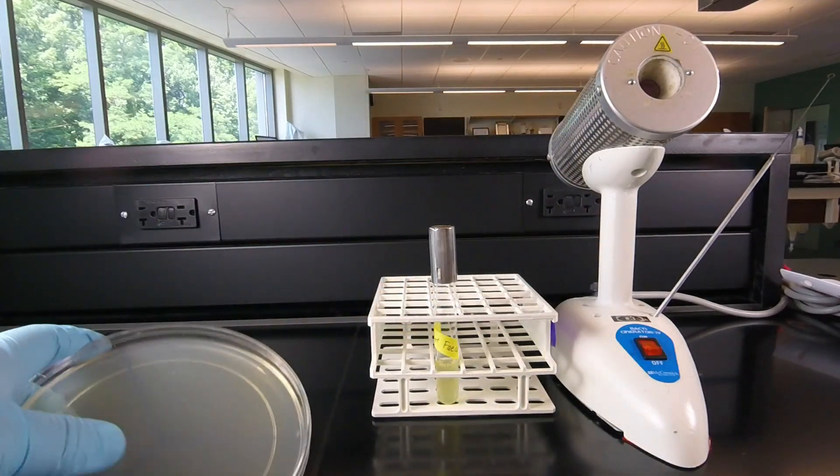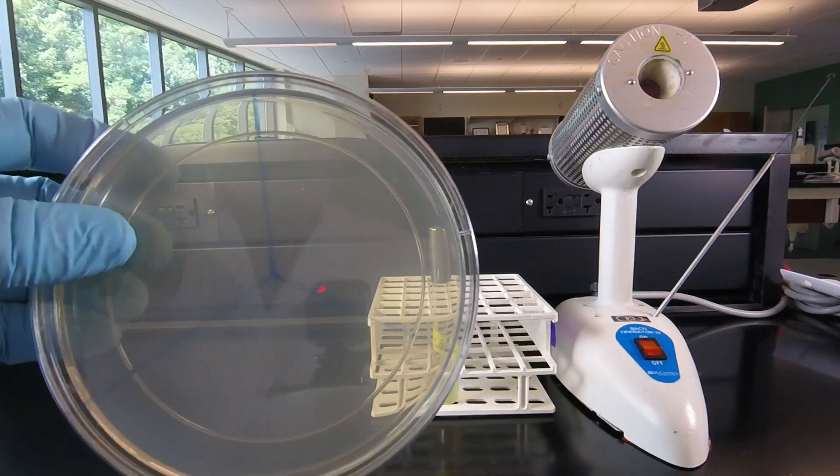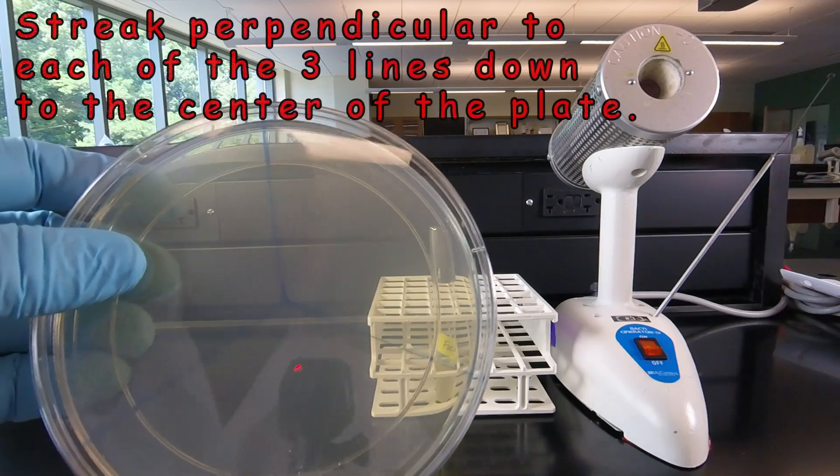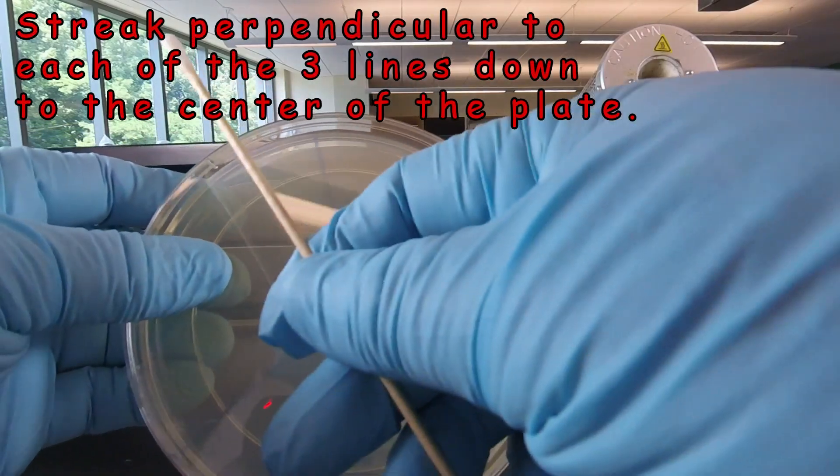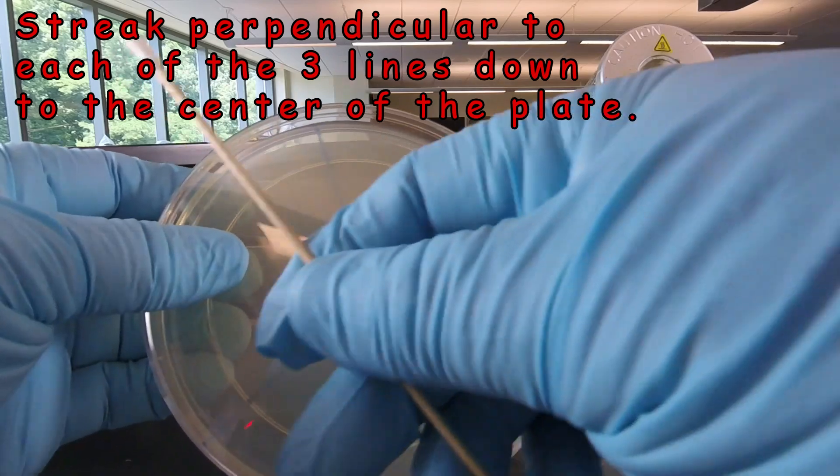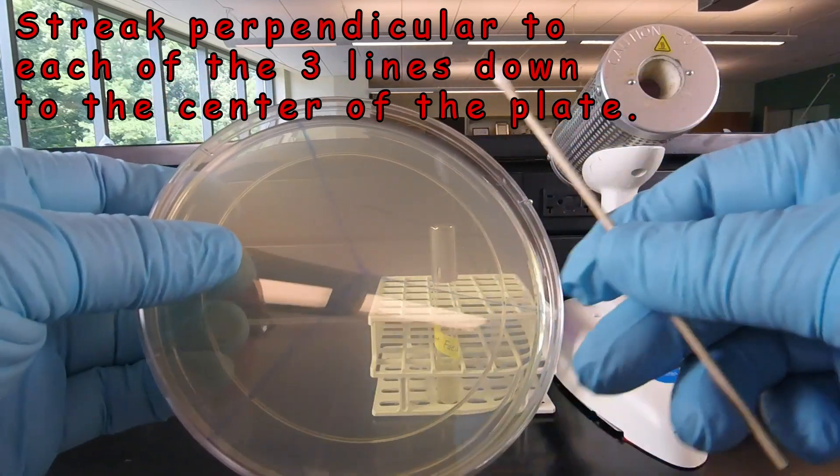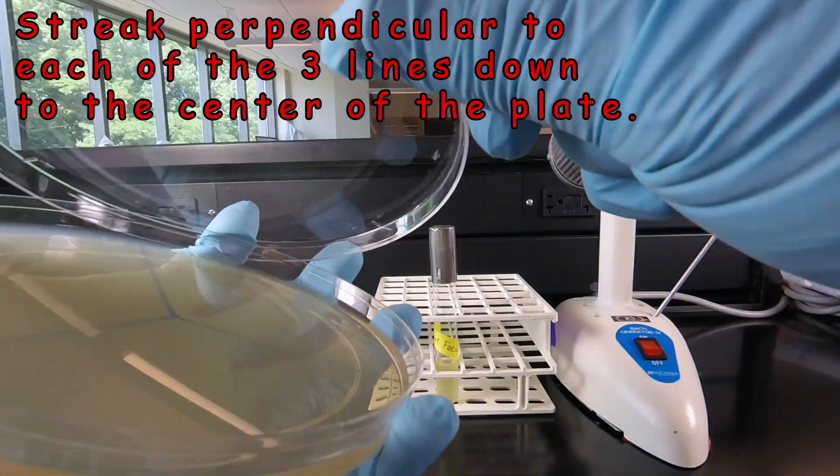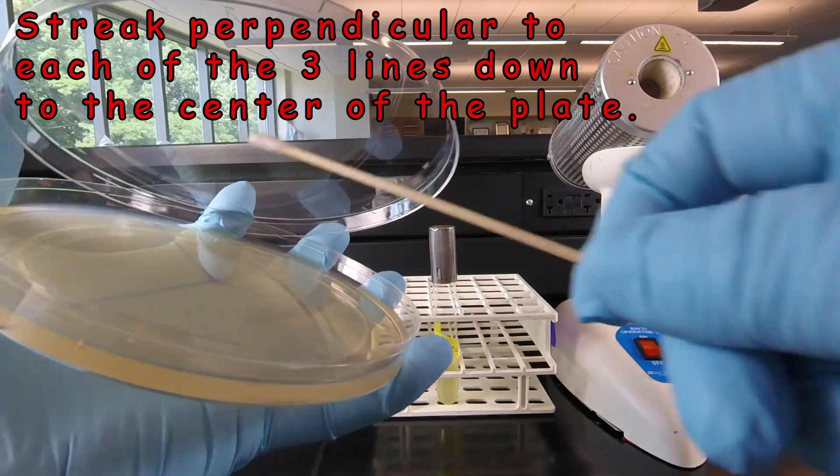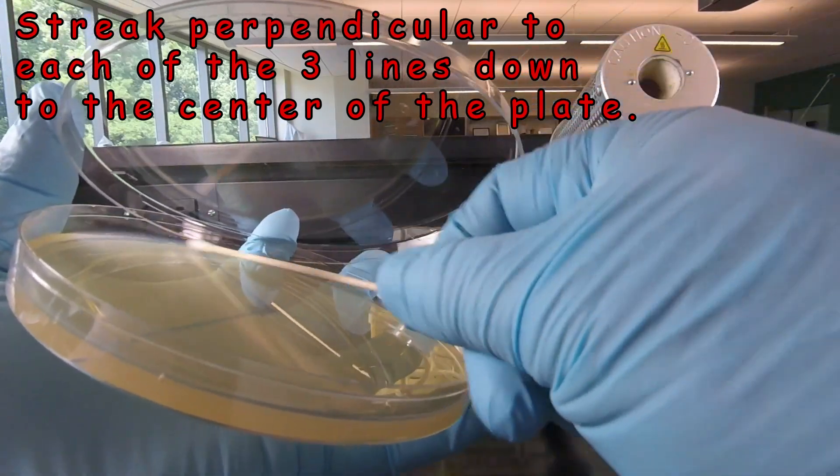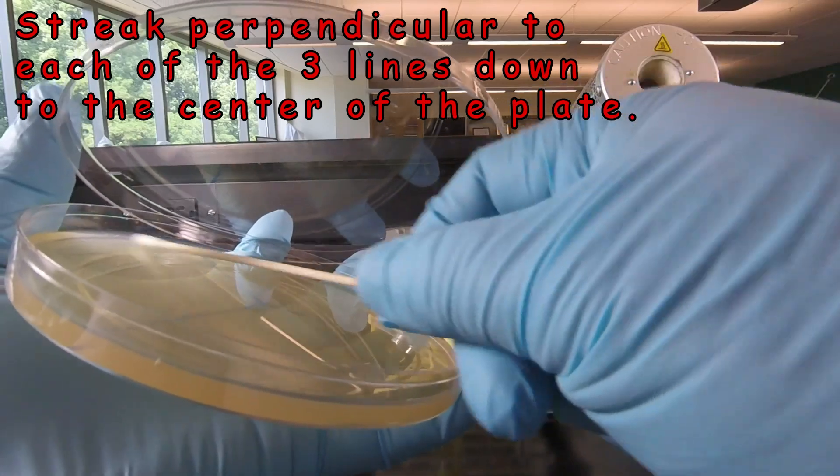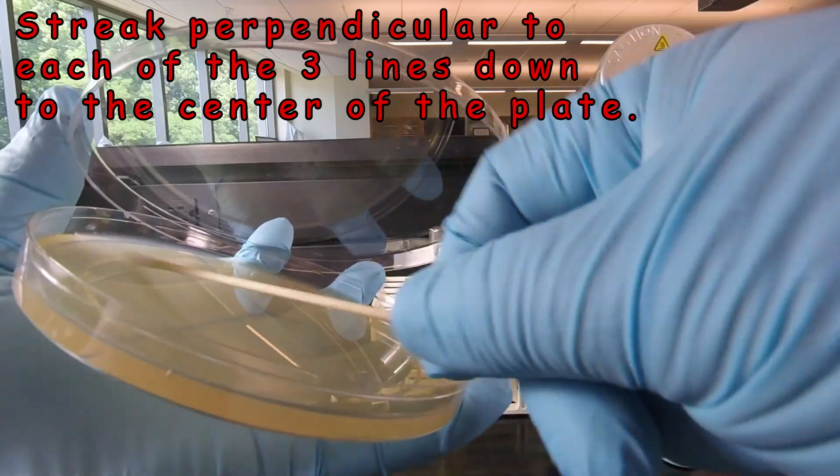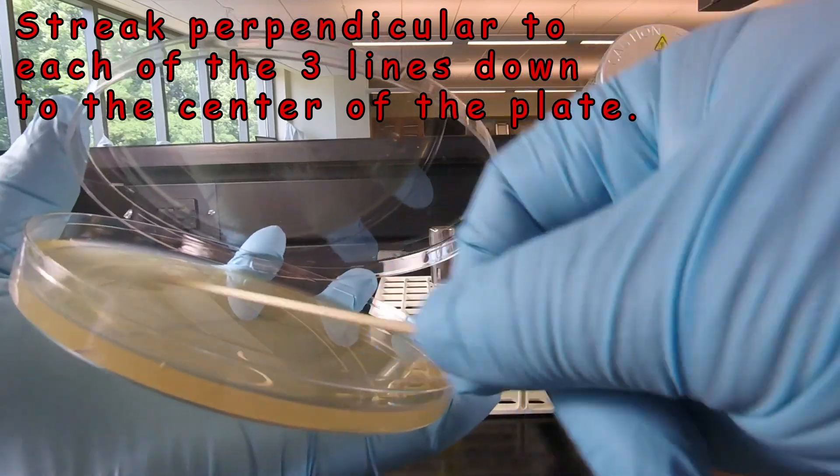Now we're ready to streak the plate. We've divided our plates into thirds, as you'll see in the illustration in your lab manual to help guide our streaking, and we're going to streak perpendicular to each line, going all the way to the edge of the plate and overlapping the lines, working our way down to the center. So we lift the lid, and we're going to go perpendicular to this line. Notice I'm going all the way to the edge of the plate, and I'm overlapping the lines until I hit the center of the plate.